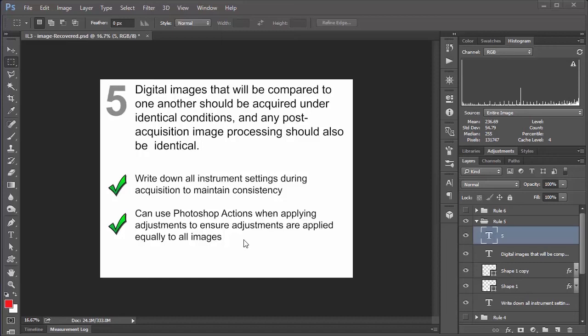And a great way to do this is using actions, which I do cover in an earlier video. But when you use actions, it allows you to record basically whatever you're doing. So say for instance, you're changing levels, you record it once and then you could apply it to the rest of your images and those same values will be applied to every single image that you use the action on. So that's just a good and easy and quick way of making sure that any adjustments that you're doing are the same across your entire experiment. And yeah, that was a quick one. So let's go on to number six.